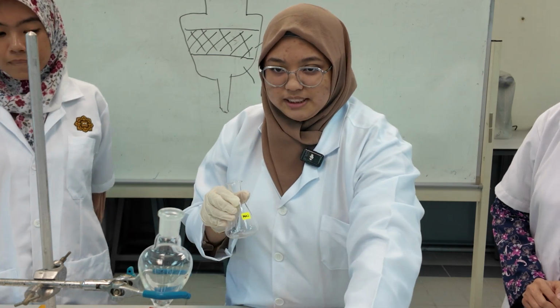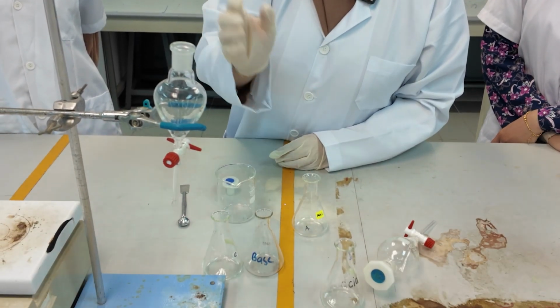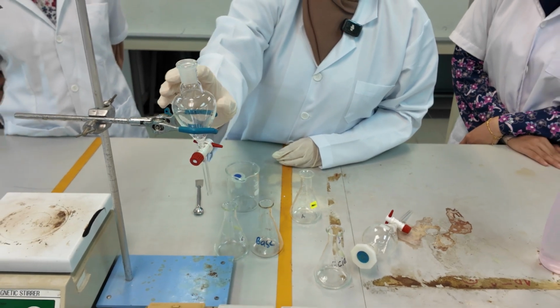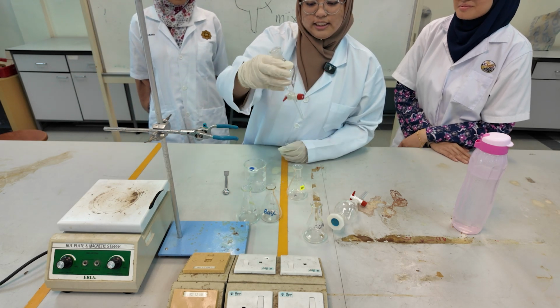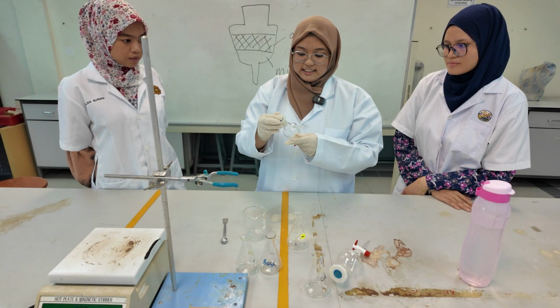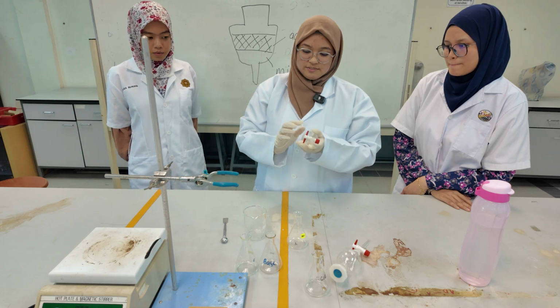The acid has already been separated, so we just pour this in, and then we add 10 milliliters of 5% hydrochloric acid. Just like before, we shake it vigorously and release the pressure.